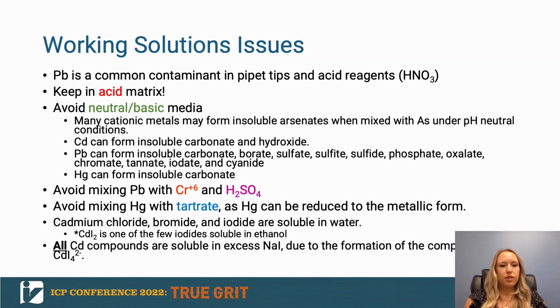Another thing to keep in mind with lead is that it will have issues with chromium-6. This is not going to be an issue if you do keep your solutions in acid matrices, as the chromium-6 is going to be converted to chromium-3 under acidic conditions.